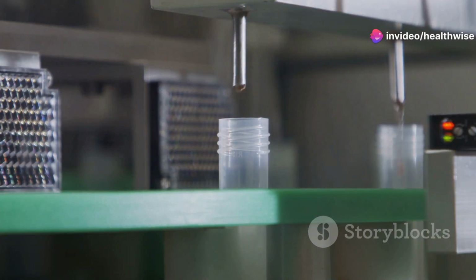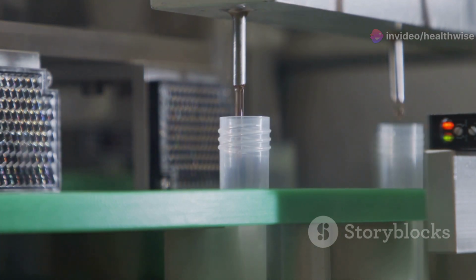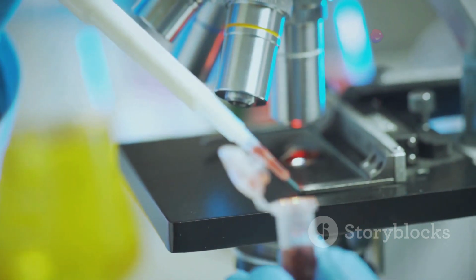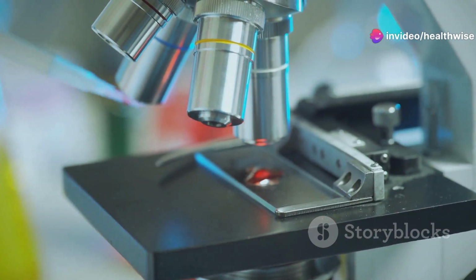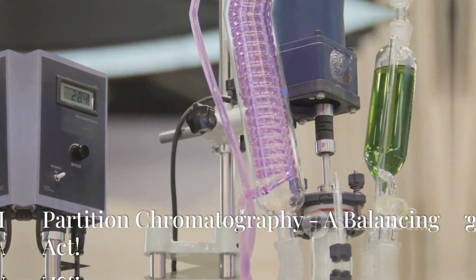Once we've captured our target molecule, we can release it from the ligand by changing the conditions in the column, such as the pH or salt concentration. Affinity chromatography is used in various applications, like purifying antibodies for medical treatments, isolating enzymes for industrial processes, and studying protein interactions in cells.